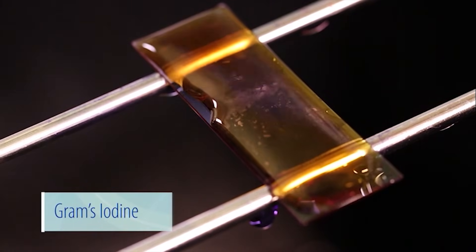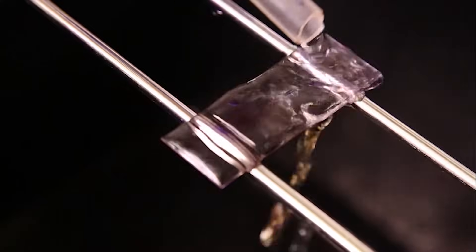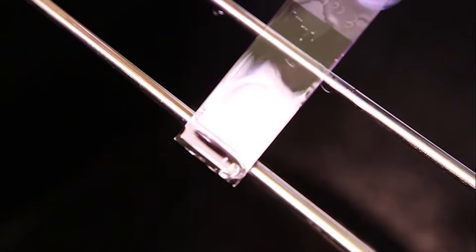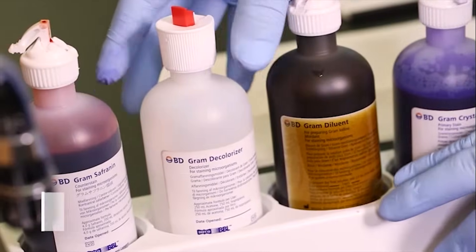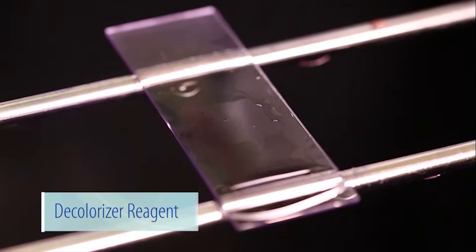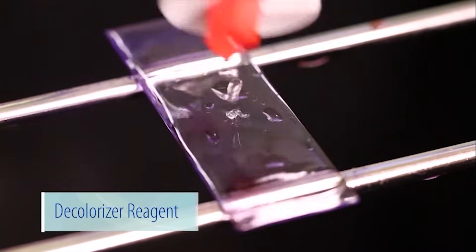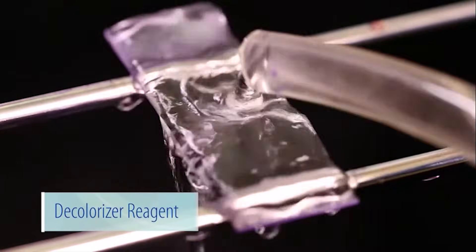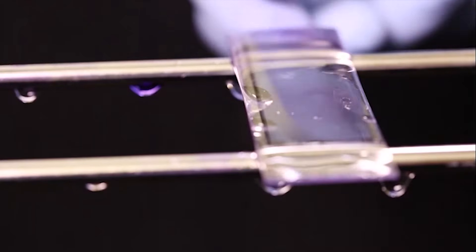After 15 seconds, gently rinse the slide with water. Tilt the slide to remove the excess water. Add the decolorizer to the slide and rinse immediately with water to help prevent over-decolorizing. Tilt the slide again to remove the excess water.